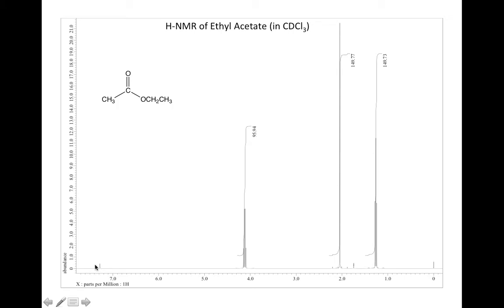So that would normally be considered the aromatic range, but it's just been shifted up there by having multiple groups. This can sometimes complicate things, but those simple regions on that handout give you a good starting point in starting to think about the spectra.